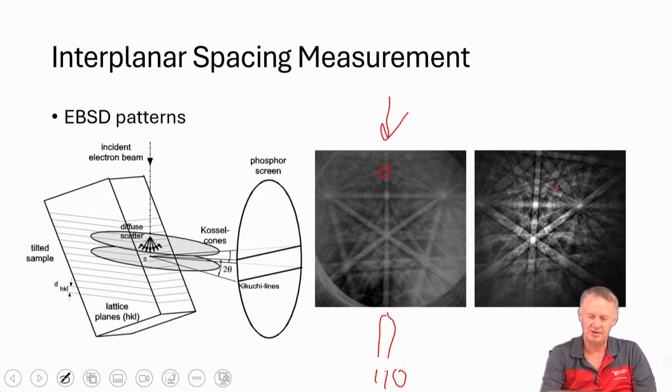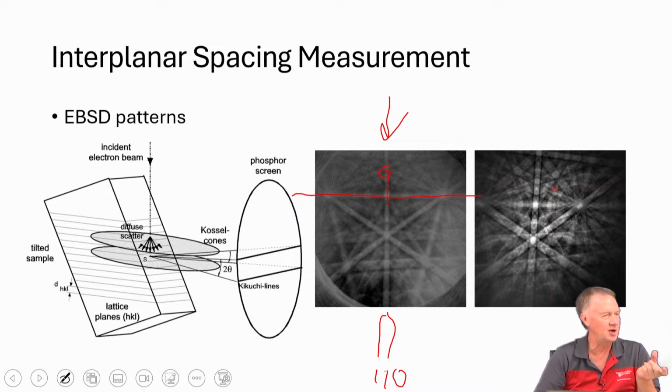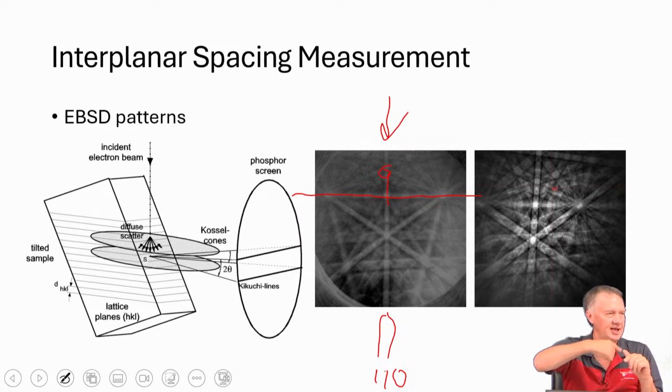So that's pattern center. So now if we want to do a d-spacing of, let's say, this band here, then we can go directly normal to our pattern center and determine where the bandwidth is. Now, the reason we need to go from the pattern center directly out isn't necessarily because of the calculation that I've showed you in 2 dimensions, to get the tangent of the angle, so then you know what the angle is.